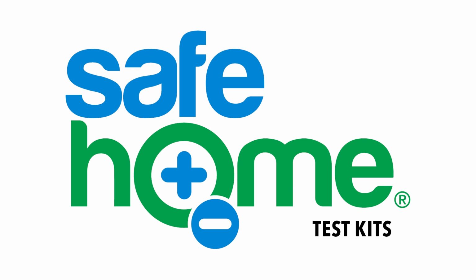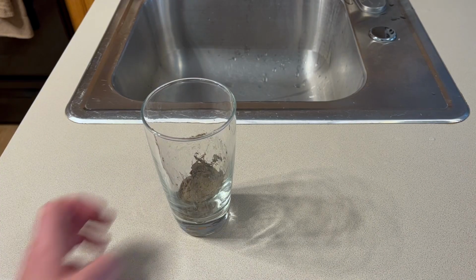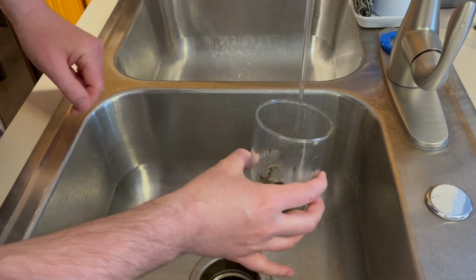How to use the Safe Home DIY Glyphosate Herbicide Test Kit to test soil. First, collect a soil sample in a cup. Be sure to collect just enough soil to cover the bottom of the cup.